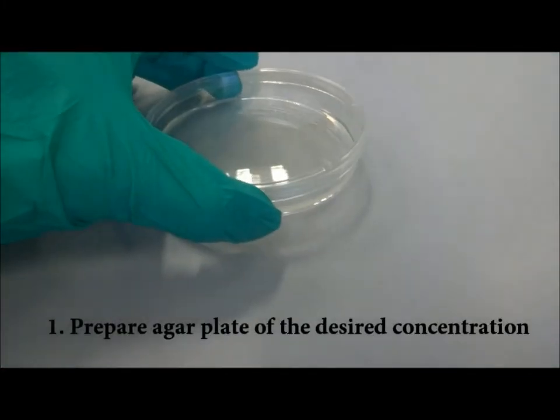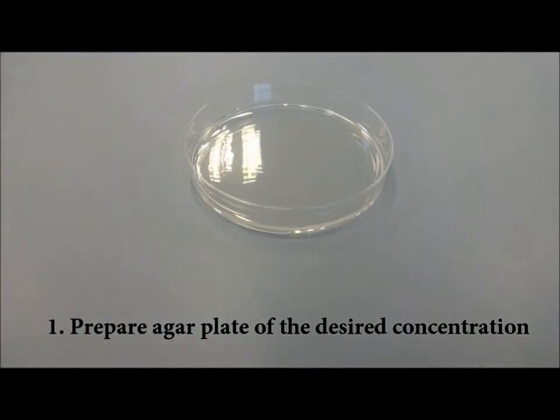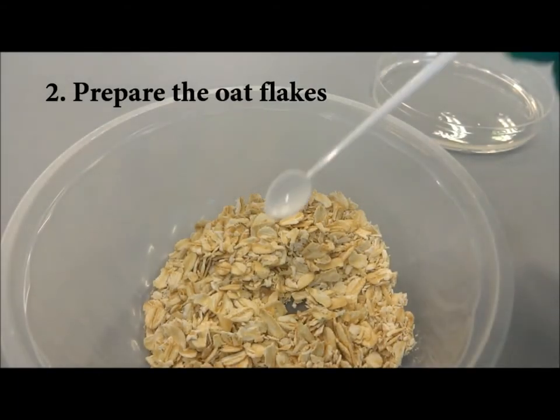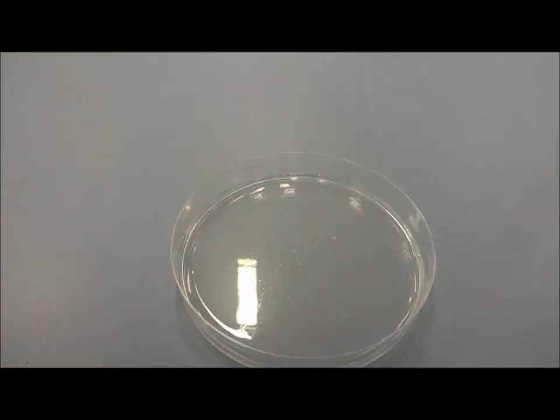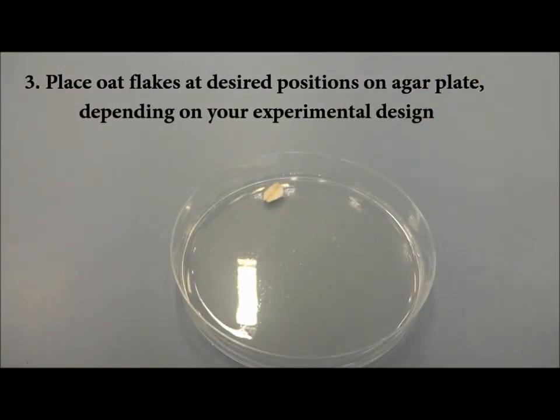Step 1. Get ready the required number of agar plates of the required concentrations. Step 2. Get the required amount of oat flakes and position them onto the agar plates. The amount and positions of the oat flakes will depend on your experimental design.